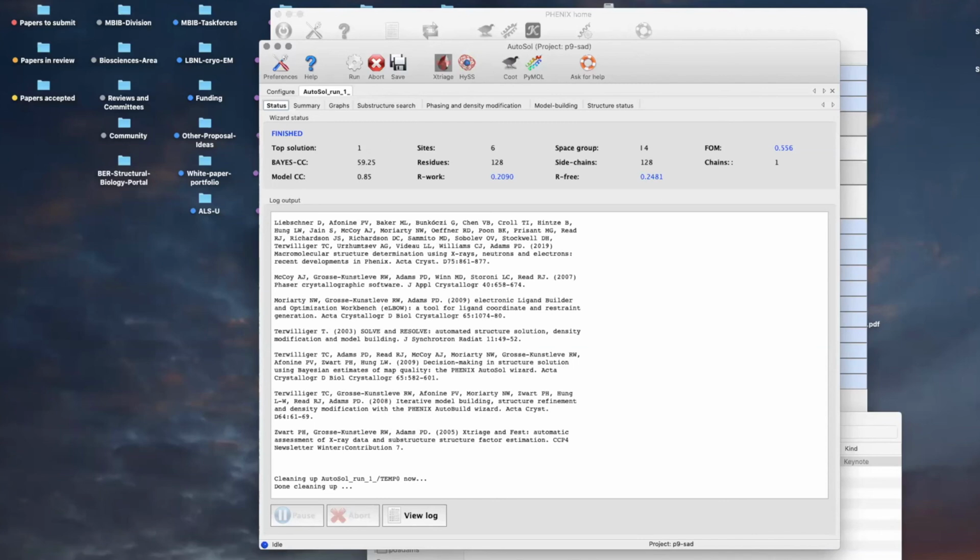If this number was low, then we wouldn't know for sure. And that does happen. People send me structures they can't solve, and I run them through and look just at these numbers. And at this point, I don't know if it is solved. It's not that easy to tell. So what are you going to do next?